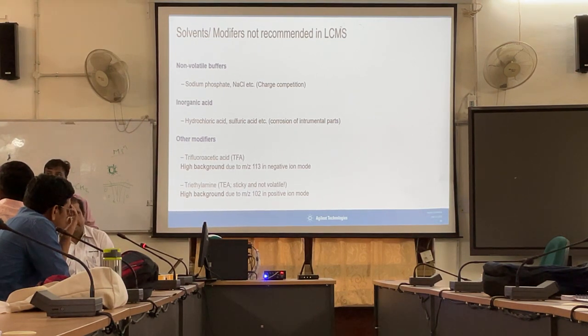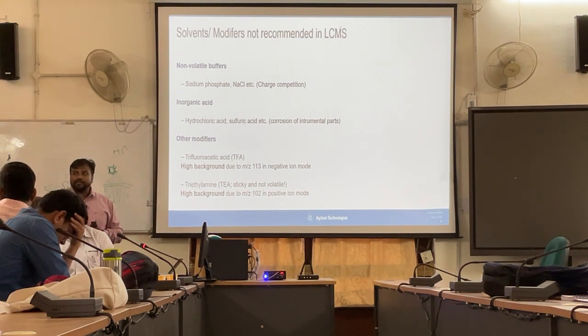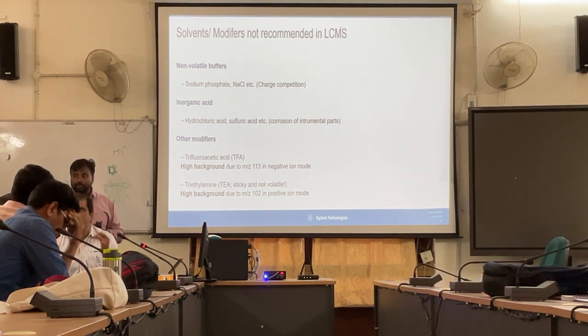Until, like ma'am was asking, there is a triethylamine in the sample, then somehow on the basis of sample spectra you can identify, okay, there is a triethylamine. Assume that you are continuously injecting the triethylamine with the mobile phase, then it will continuously come on. Even the blind would also have the same masses. Then there would be a challenge.